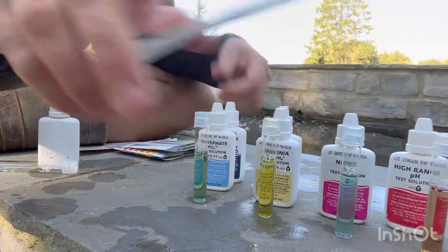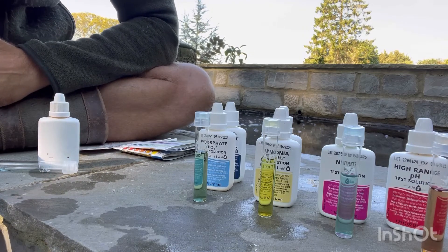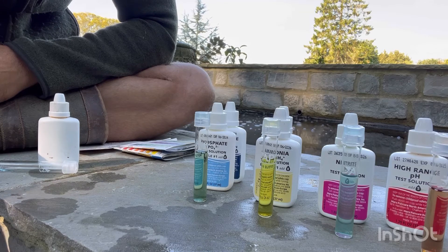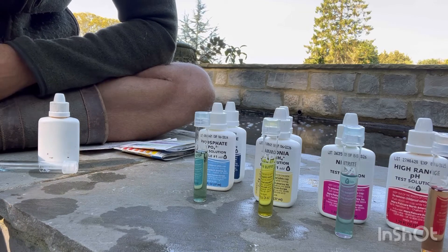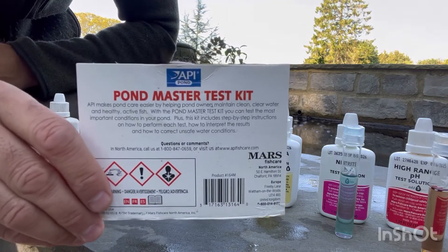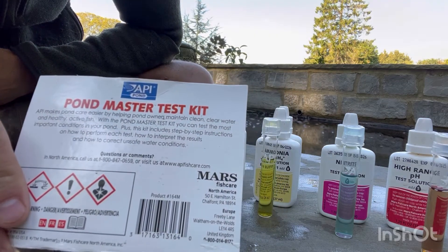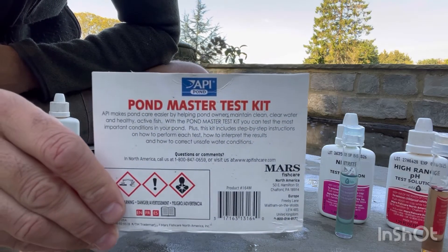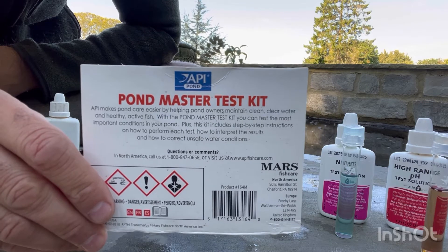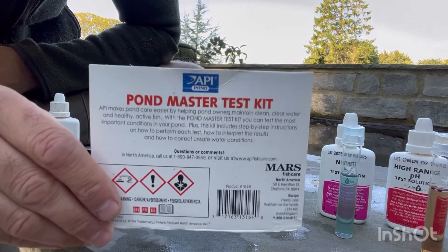So there you go — I can't recommend it enough. If you're going to get into koi fish keeping in any sense, water quality is what it's all about. You're there to maintain that water quality, and that is by de facto looking after the fish. So get yourself a decent water test kit — don't use the strips. Use the API pond master test kit and test it once a week, or perhaps more often if you're worried or if the fish are starting to exhibit some strange behaviors. Works a treat — get it done. Hopefully that helped.